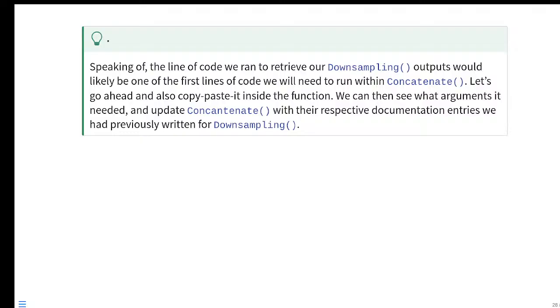That's one possibility if you're trying to do a complete mismatch of things, bringing them together under a similar roof. And then once you have those combined into a broader concatenated file, you could try wrapping them in some kind of metadata. So it's definitely something you can tinker with and experiment with, and it's possible. It's just a lot more moving pieces around.